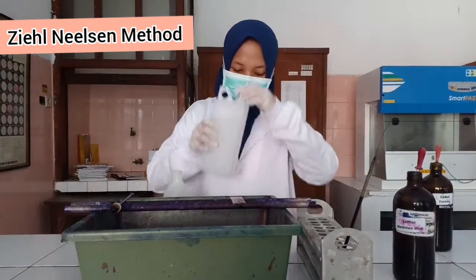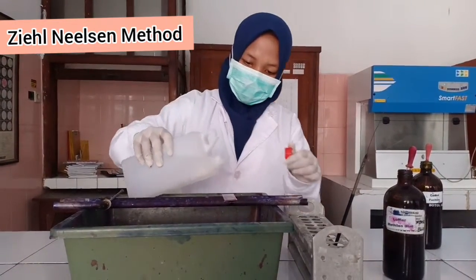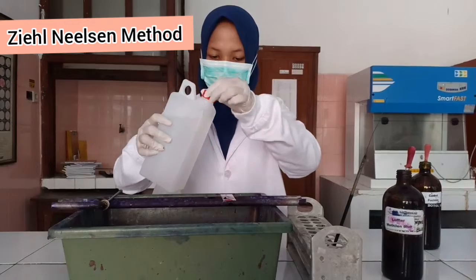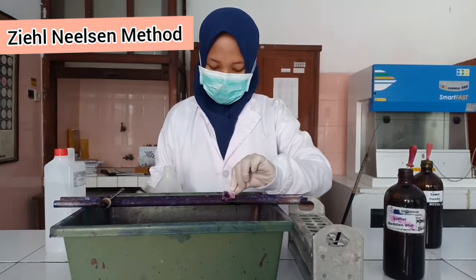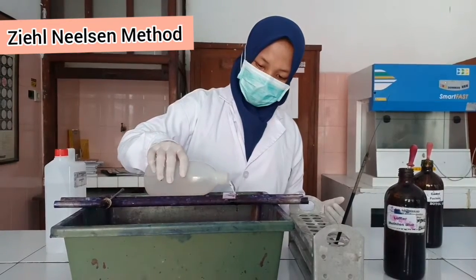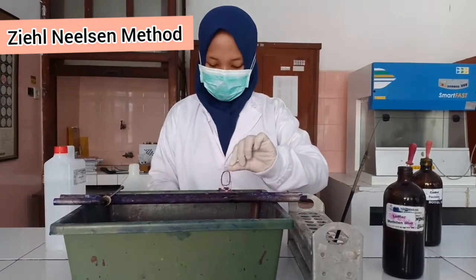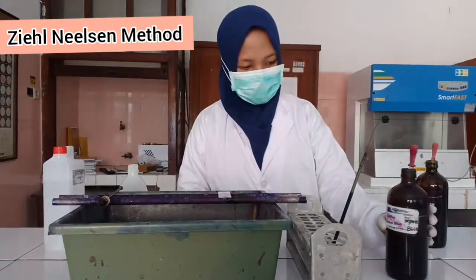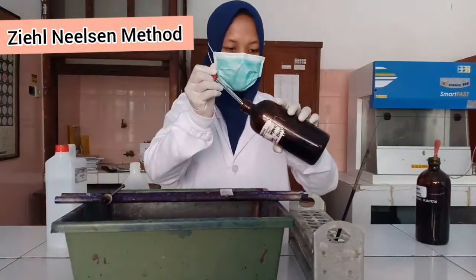After that, decolorize with acid alcohol until pink for 30 seconds. Rinse with water for 5 seconds. And then counterstain with methylene blue for about 2 minutes.